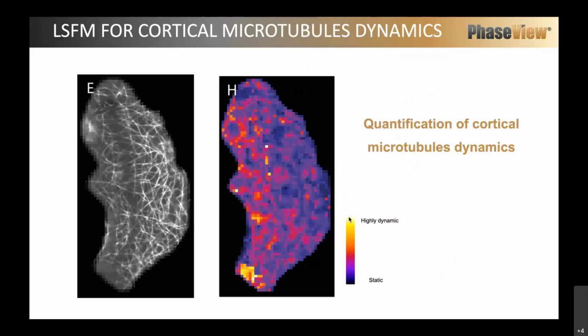And so this microscope and this kind of microscopy, the alpha-3, for the aerial organ of plants, you can do really fast imaging in order to follow fast biological processes and do some quantification on these processes.